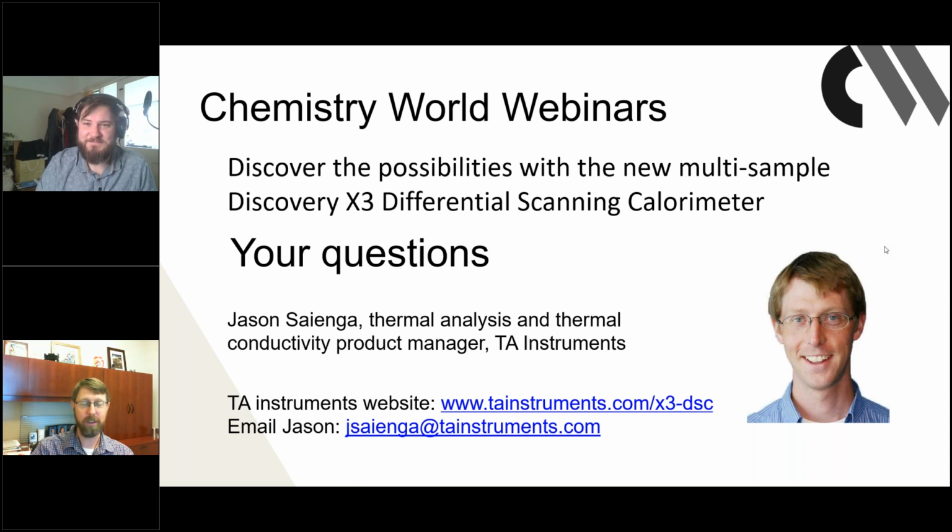So, I will say, traditional DSCs commonly range from about -180 on the low end to about 700, 750 degrees. So most DSCs that you would directly compare to the X3 or the other Discovery DSCs that we have are kind of in that -180 to 725, 750 temperature range.